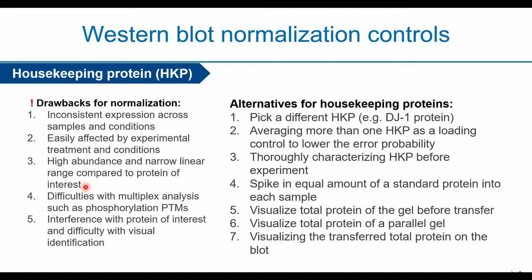And as we talked about in the previous two sessions, we know that chemiluminescence is really good at detecting a single protein on a blot. It's very sensitive. It's very good for a single protein. But if you try to detect more than one protein at the same time on a blot, you will face certain difficulties. For example, you want to detect a phosphorylated protein and a total protein that couldn't be separated by gel electrophoresis based on their molecular weight, because both of them have similar molecular weight. Then you have to go for either the chemiluminescence method, strip and reprobe, or you do it in a parallel gel. These two have their own perks and also major drawbacks as well.